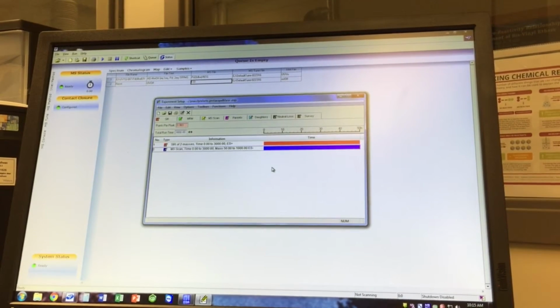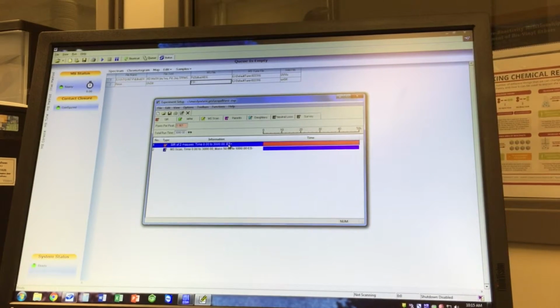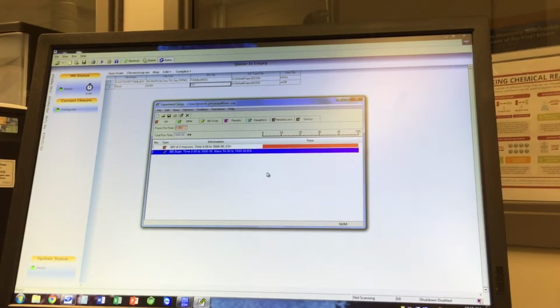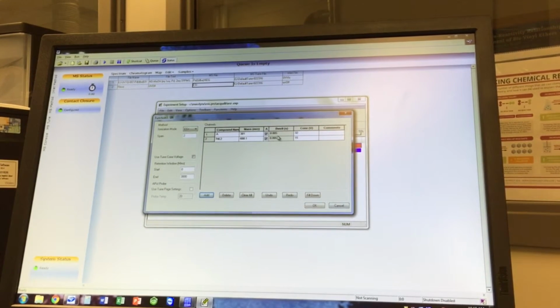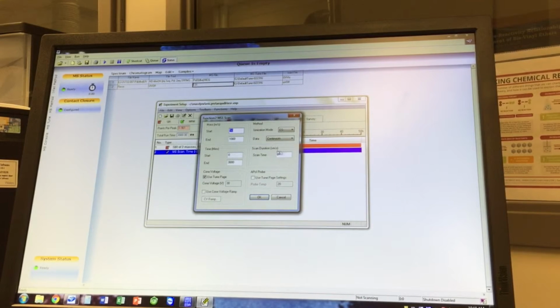Now you'll notice that the time scales here are overlapping, so you see I have an SIR that's running from 0 to 3,000. I have an MS scan, full scan, going from 0 to 3,000. So what it's going to do, in order, is this for 10 milliseconds, and then switch over to this one, and this will take 2 seconds.